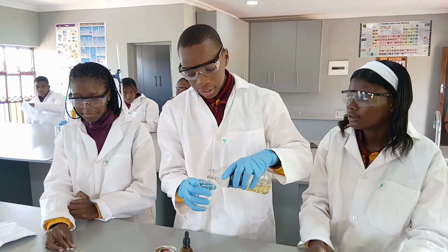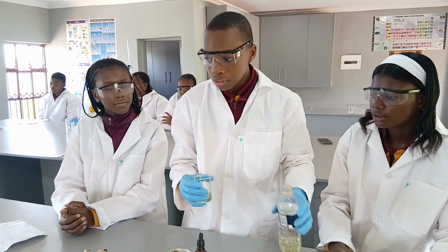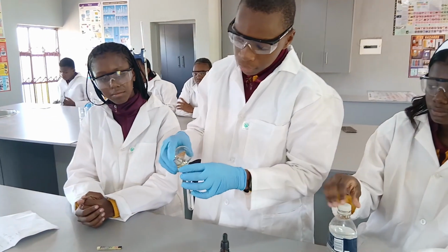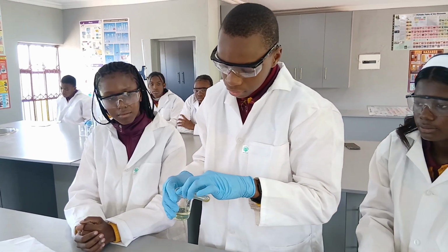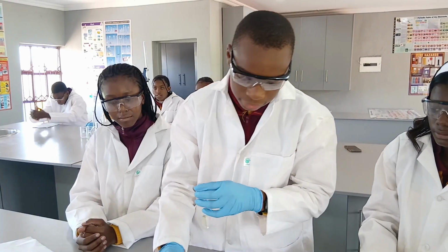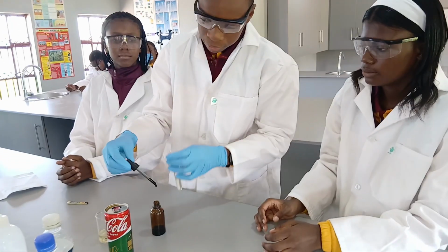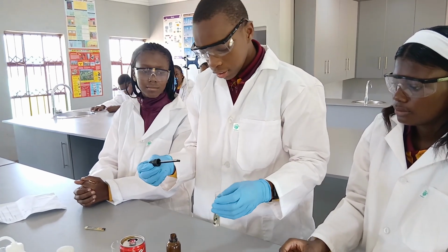Our second sample, into this beaker so we can transfer it over to our test tube. So our second sample is cooking oil. So we want to test if it's an acid or base. So we pour 2 drops of our universal indicator in here, and then we'll shake it.